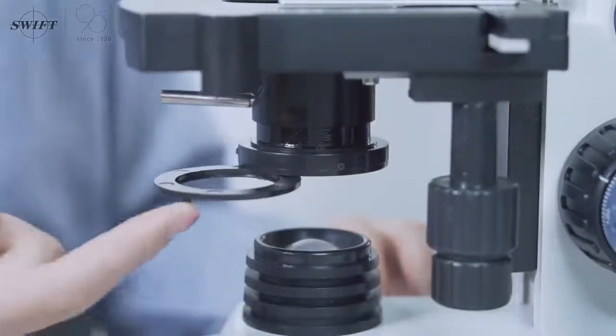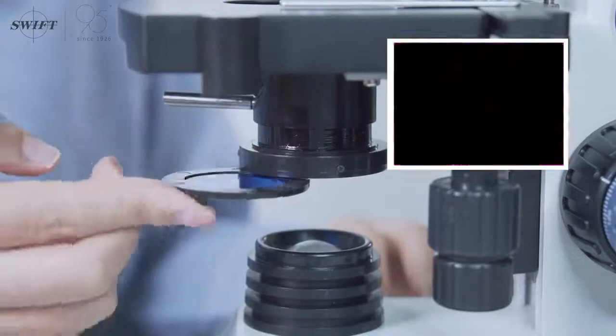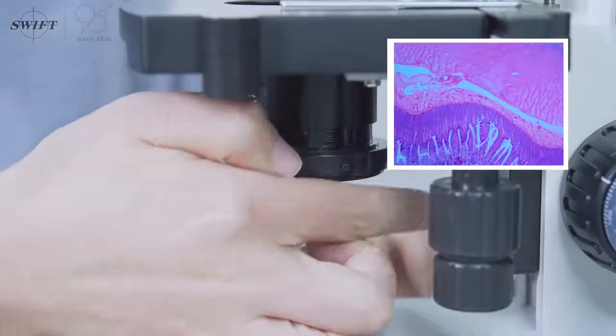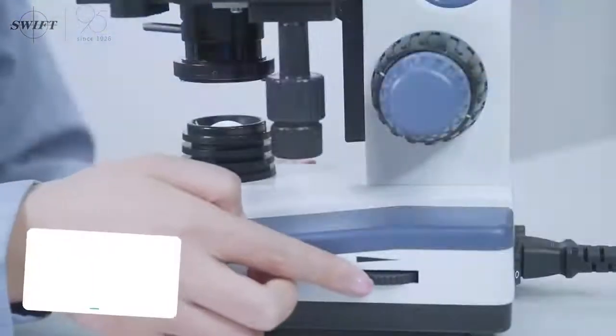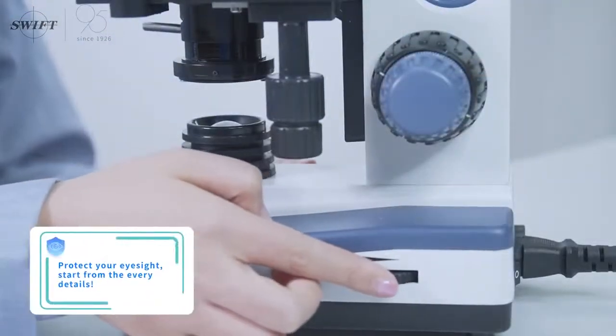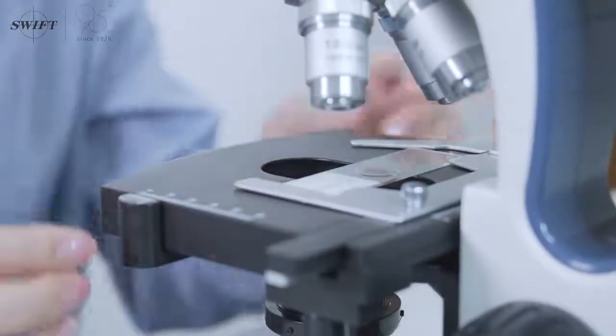The color filter will make the light source closer to natural light, and the image under the mirror will be more realistic. Turn on the power switch and adjust the brightness of the light source properly to avoid hurting your eyes. Put in the slide preparation and observe the sample target under the microscope.